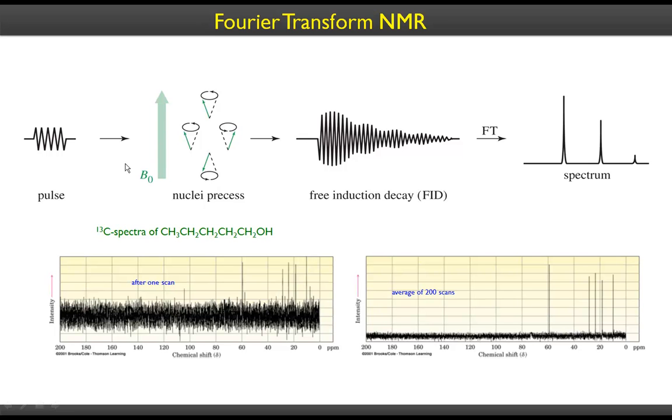And just to recollect all the things that we learned, we have radio frequency light, that's the oscillator, and we have an external magnetic field. We place our sample in the probe that we talked about already, how to collect, how to make the sample, what solvents to be used, and how the instrumentation works. It's pretty much the same as how proton NMR works. It's the same magnet, same NMR instrument, same NMR tubes, just that we dissolve more compound because we need to have more carbon-13s to give us NMR signals.